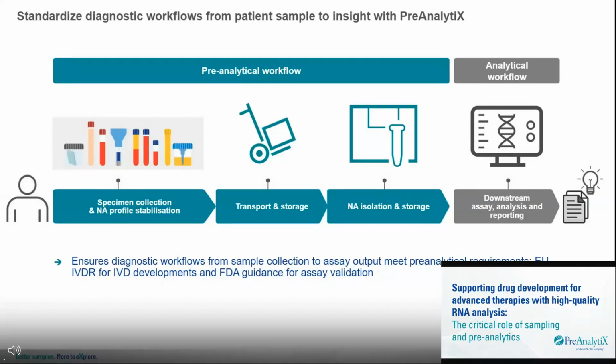Therefore, all pre-analytical steps should be standardized and meet the pre-analytical requirements defined in the EU in vitro diagnostic regulation for workflows in Europe. And also the FDA recognized the importance of the pre-analytical phase by providing the guidance for assay validation to encompass the entire workflow from sample collection to assay output. It's very important to consider and understand this, and that the analytical test result is always a result of an entire workflow, and the pre-analytical part of the workflow needs to be standardized.